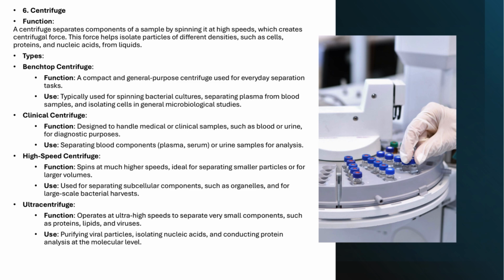The benchtop centrifuge is a compact, general-purpose machine commonly used in labs. It's perfect for everyday separation tasks, such as spinning bacterial cultures, separating plasma from blood samples, or isolating cells for various microbiological studies. Clinical centrifuge.